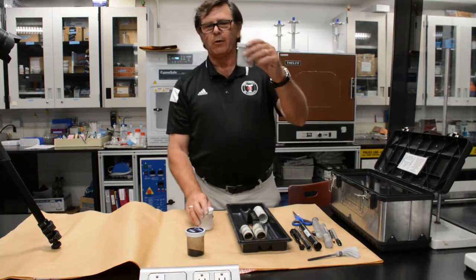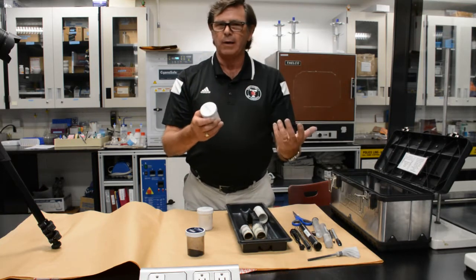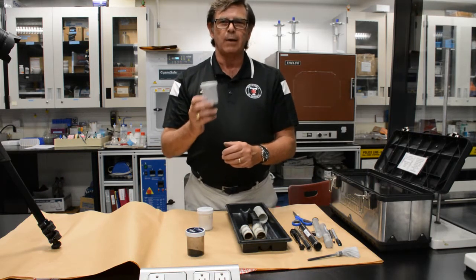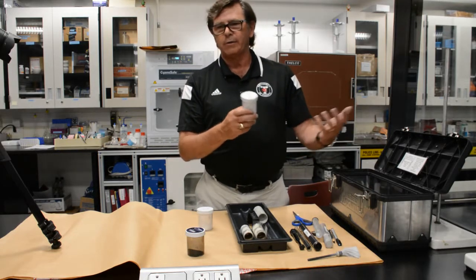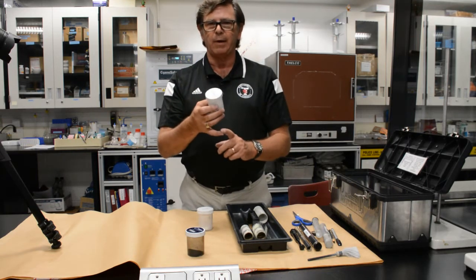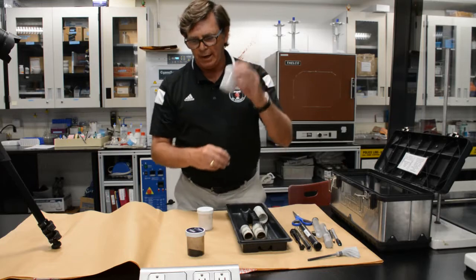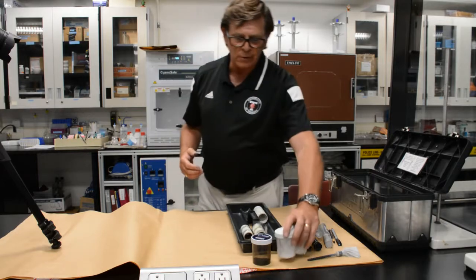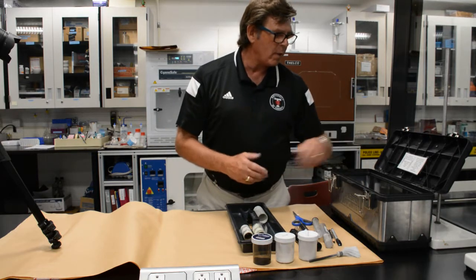The other reason why there's a smaller quantity of powder in the jar is that because it does have an affinity to moisture, and with humidity conditions or precipitation that might be present in the air, it will get contaminated. It could even be with biological things if you're fingerprinting something that maybe is blood or some other contaminant. So rather than throwing out a complete jar of powder because it's contaminated or because it's started to break down because of moisture content, it's more a conservation thing. Rather than throwing out an entire jar, only a smaller quantity of it is discarded. So we'll set those brushes and powder jars aside for a moment, and we'll continue on.